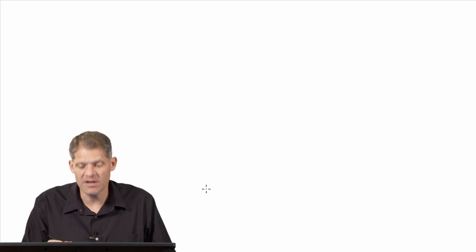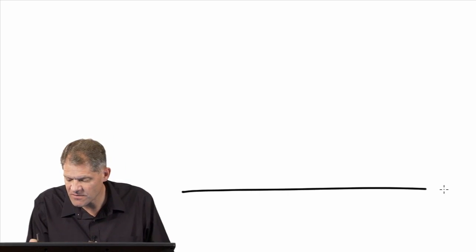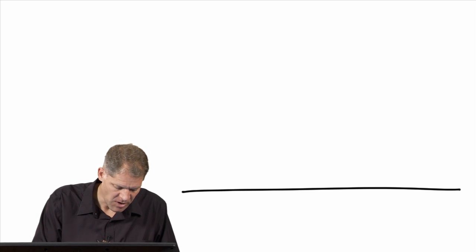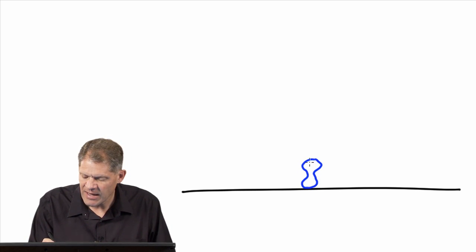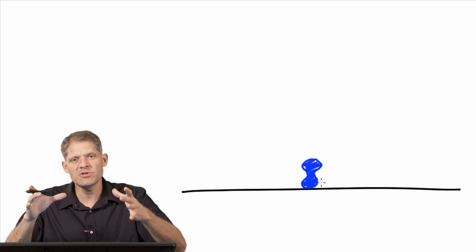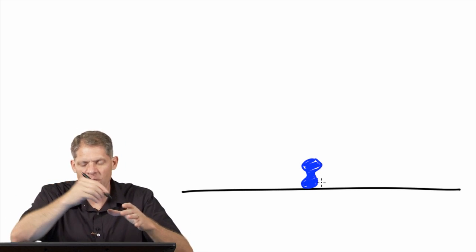Let me illustrate this on the tablet. Imagine that this is the grid, and then there's some object of interest on that grid, for instance, the DNA and the enzymes bound to it sitting on that grid. Now it's a rotating platform that's rotating around and around.